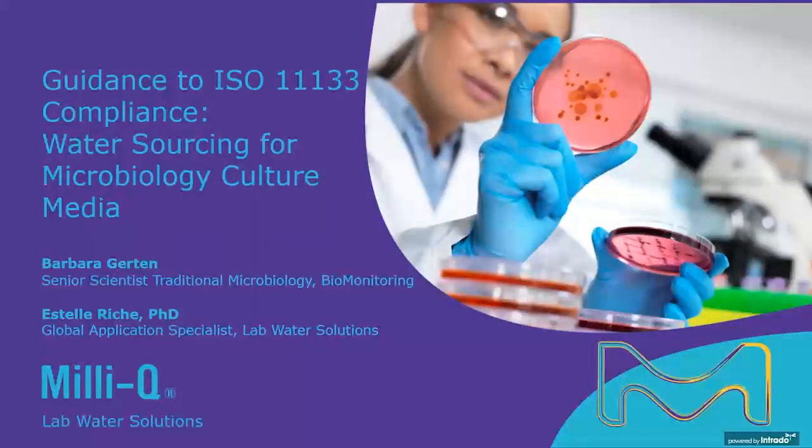So my name is Estelle and today we will talk about the importance of the ISO 11133 standard for the preparation and performance testing of culture media that is used for microbiology testing of food and of feed and of water also. We will take a slightly different angle maybe than you're used to, in that we will talk about water. We'll discuss how to select a good water source that can really help you improve both your test accuracy and reproducibility and also your lab efficiency and productivity.